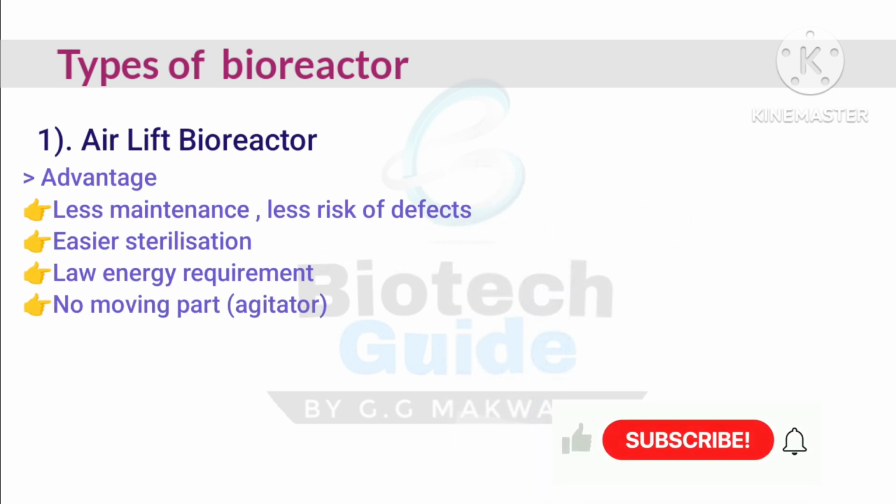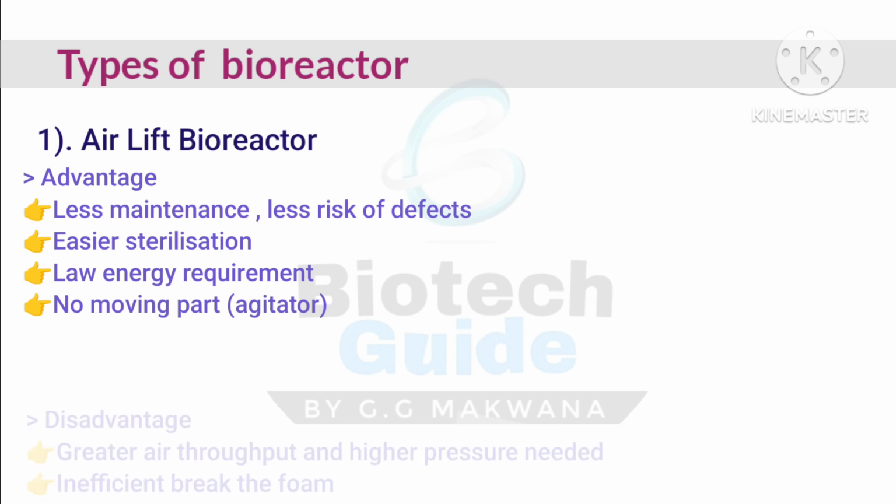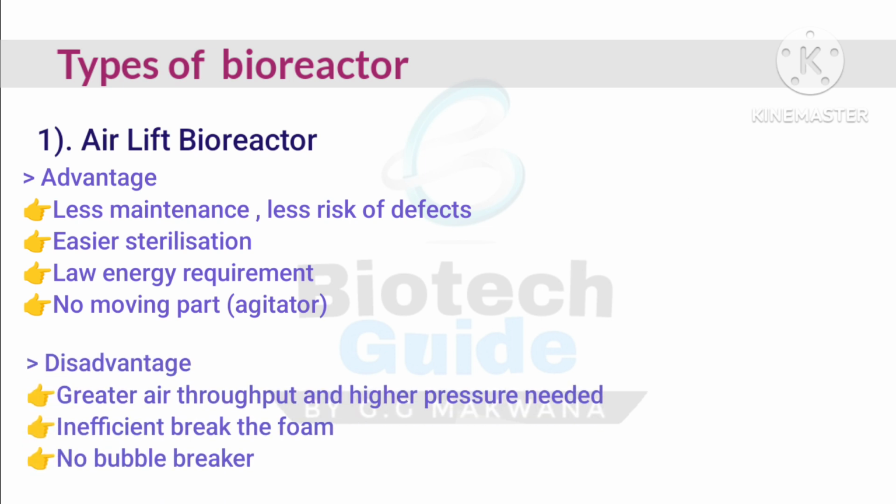Then advantages and disadvantages: less maintenance, less risk of defects, easier sterilization, and low energy requirement due to gradient circulation happening, and no moving parts. Disadvantages: greater air throughput and a higher pressure is needed, inefficient breakup of foam, and no bubble breaker is there.